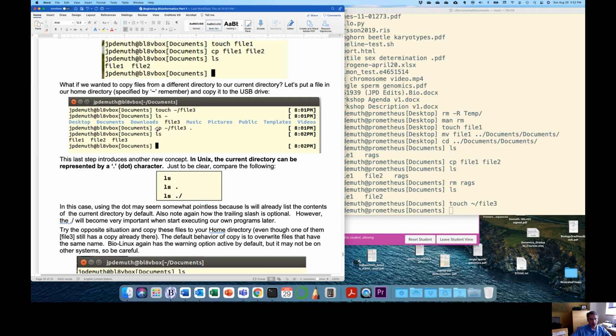Now, this command right here says copy file 3 from my home directory, and then there's a space and a dot. So remember earlier, when we opened the Finder or the File Explorer from over here, right? I did like open space dot, and I said that dot, well, at least I think I meant to say that's the current directory. Maybe I didn't say that. So open dot says open the working directory that I'm in.